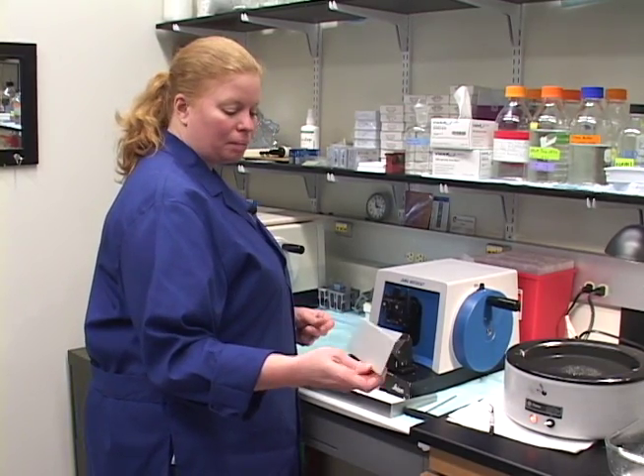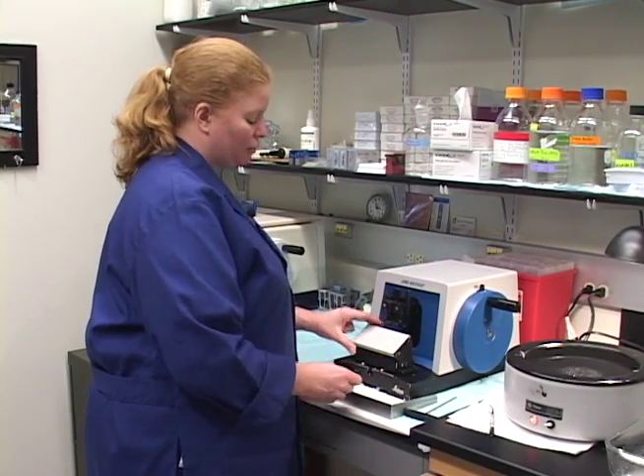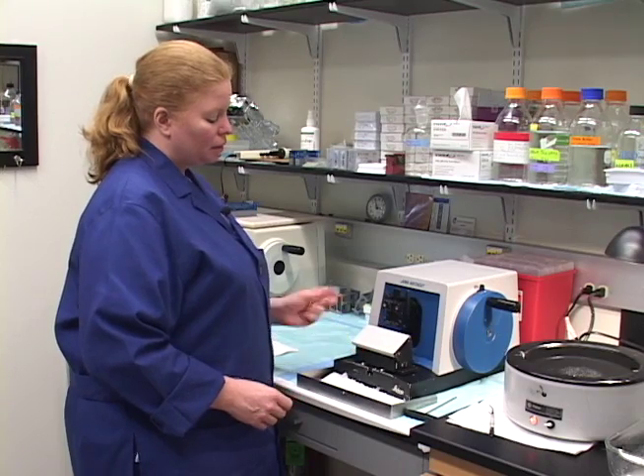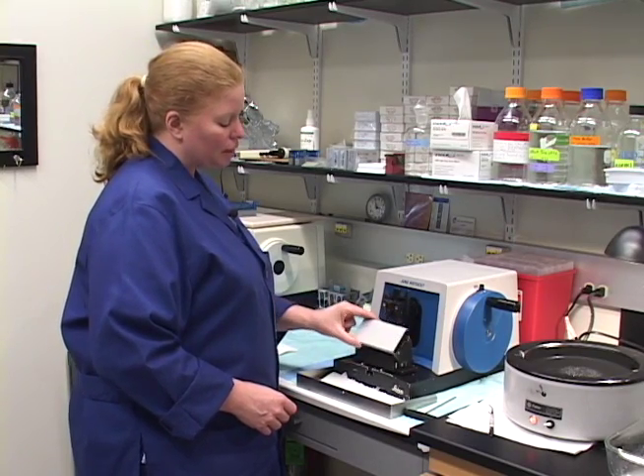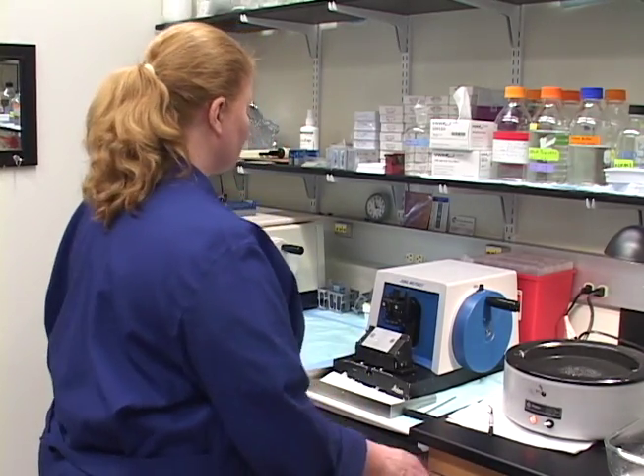I do have this blade cover here that was left for me for this microtome. If somebody wanted to use it — I never really use it. I just remove the blade and keep that habit; it's in the drawer if somebody does want to use it.